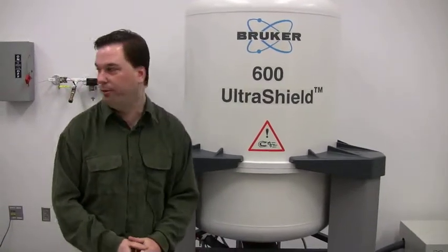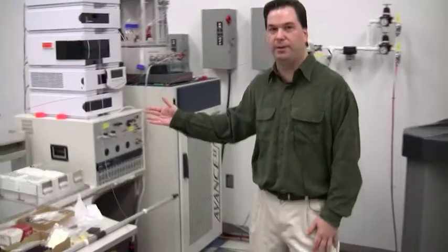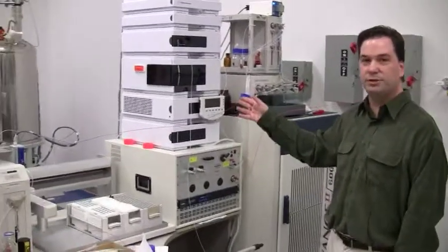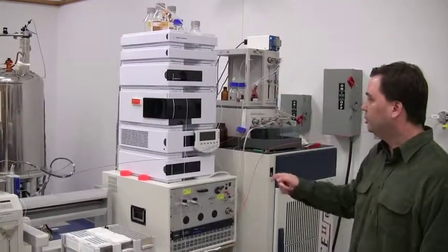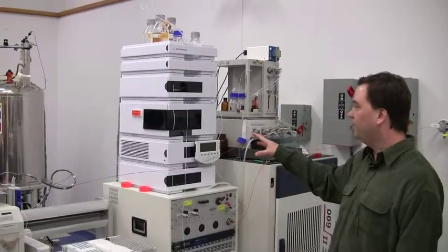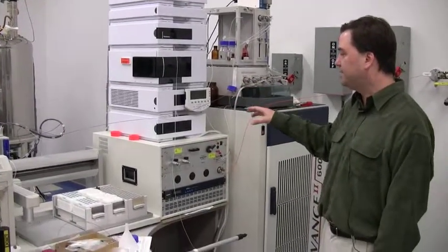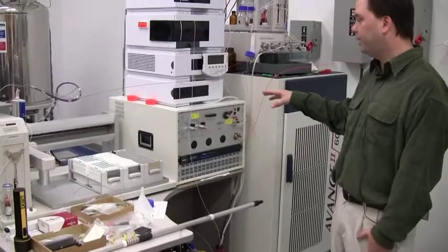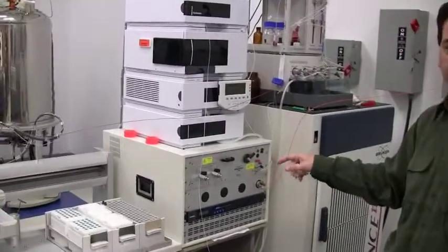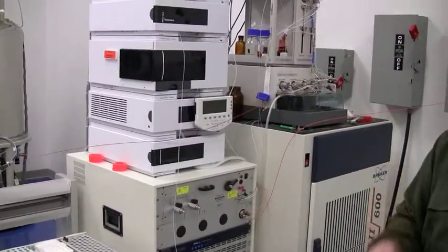The other unique thing about the spectrometer is we have it hooked up in line with an LC-SPE unit. We could do traditional type of liquid chromatography and take whatever comes off the liquid chromatogram and send it directly to the NMR in real time.